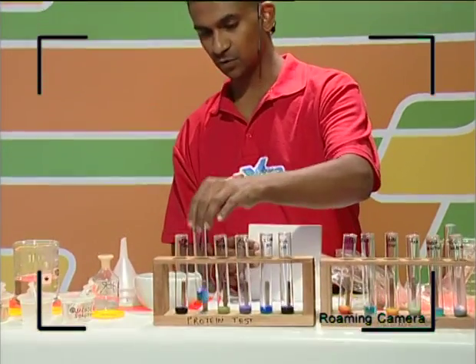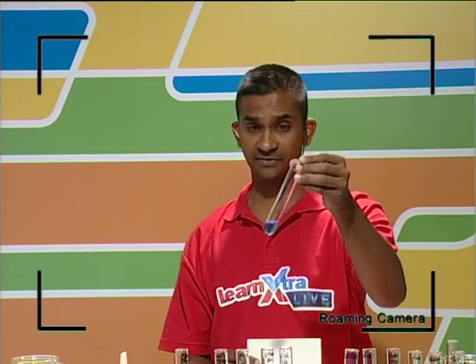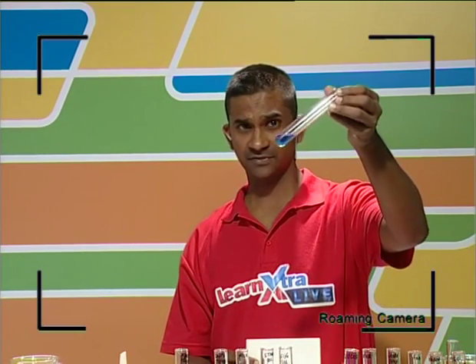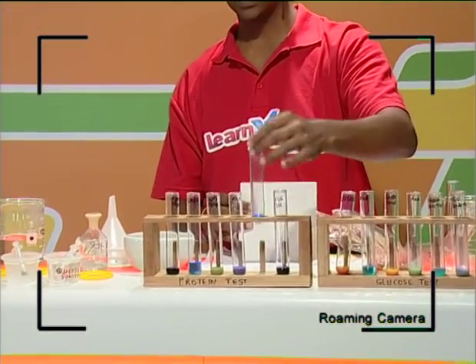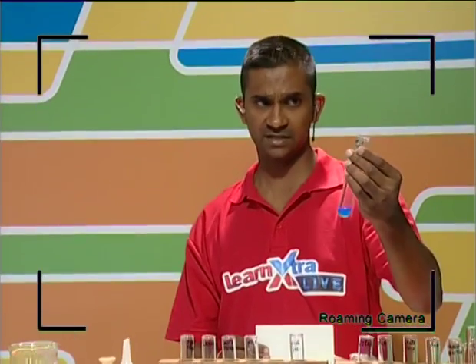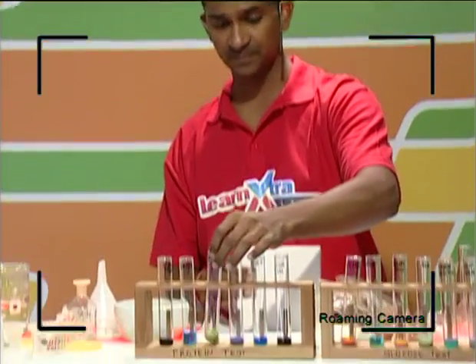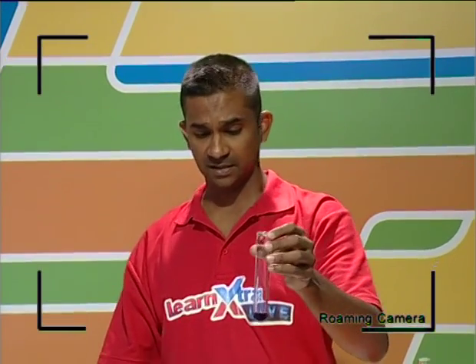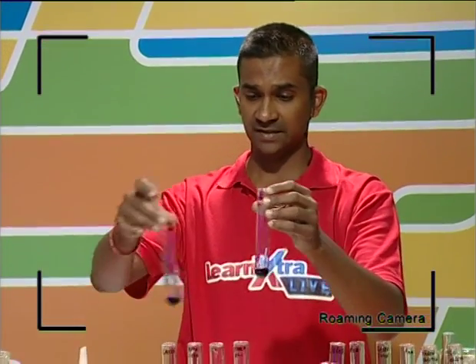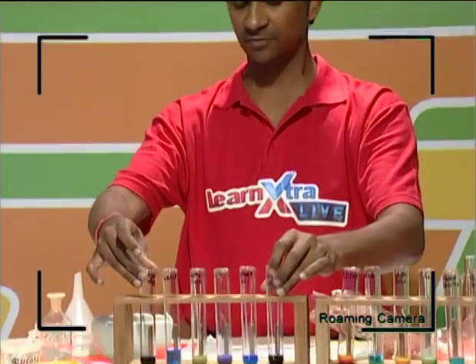Okay. And here we've got water, which obviously does not contain protein, and you can see that in the presence of the reagent, the color of the reagent remains blue, indicating the absence. So anything else that has a blue color would indicate the absence of proteins. We tested starch as well. Starch will not contain any proteins. We tested grape juice, and grape juice again did not give us any proteins. And finally, the last sample was an egg solution, obviously very similar to our positive control, and these two both indicate the presence of proteins and almost similar amounts of protein in them.